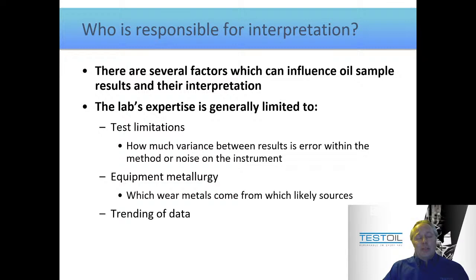But the last thing they bring to the table, the biggest tool of all they have anyways, is trending, right? They can bring trend analysis into your numbers and look back on the history, and they can identify when the trend, though the current data may actually look like a reasonable level, indicates it's not following the pattern. It's not staying where it normally would be.